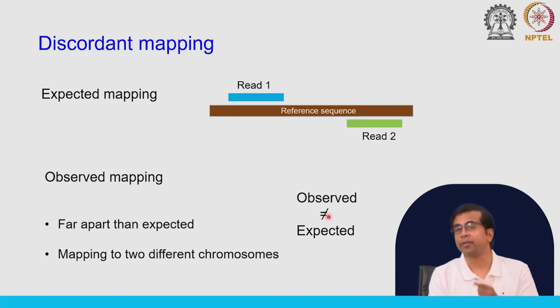If you find similar discordant mapping for many reads, you can look into it carefully and say maybe there is a chromosomal fusion or gene fusion, where one read maps to one chromosome and the other read maps to another. If you have multiple observations like that, you can go ahead and test that situation. I think that gives you an overview of the options.